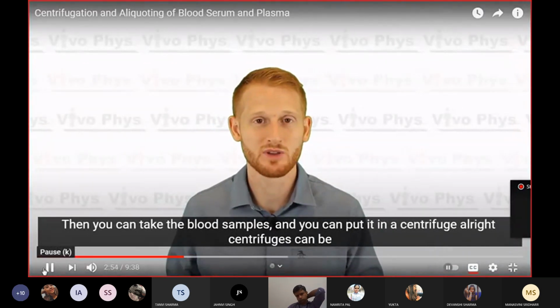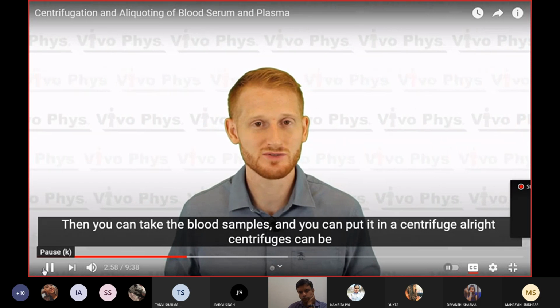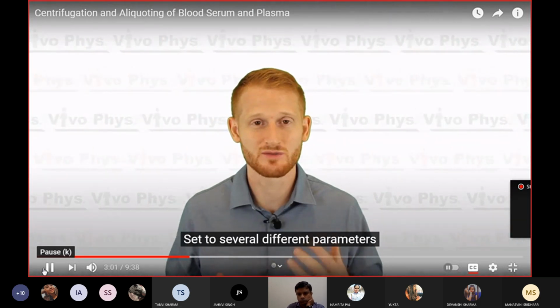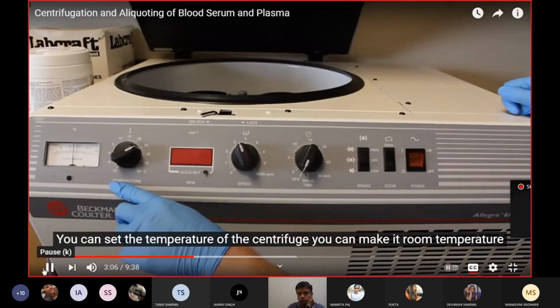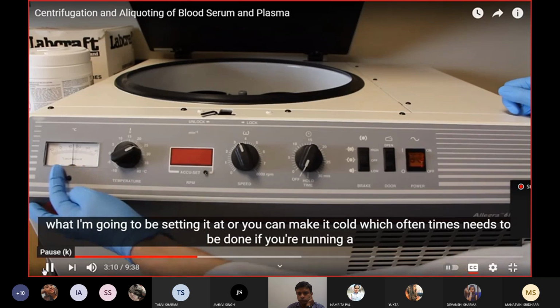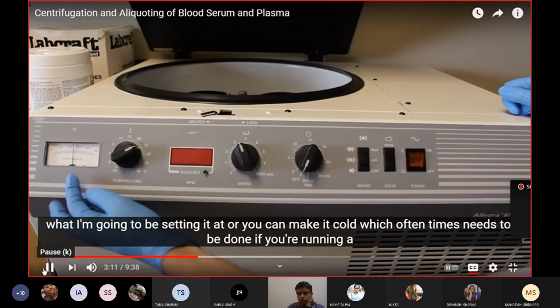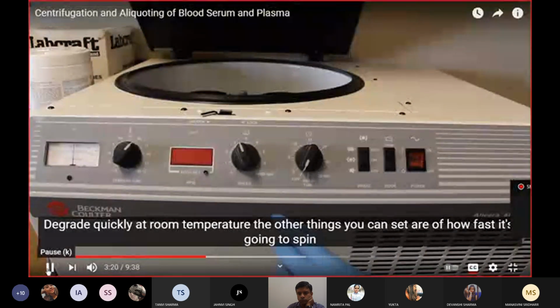All right, once you have confirmed that the blood you want to coagulate has coagulated, you can take the blood samples and put them in a centrifuge. Centrifuges can be set to several different parameters. You can set the temperature of the centrifuge. You can make it room temperature, which is approximately what I'm going to be setting it at, or you can make it cold, which often needs to be done if you're running a sample for hormones or something that's going to degrade quickly at room temperature. Again, it depends.